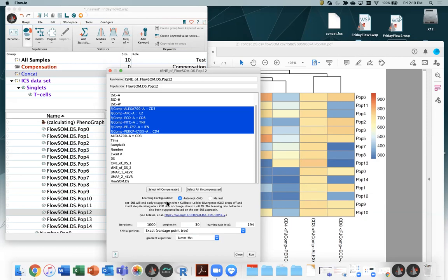We don't have those same levels of control built into UMAP or TriMap. Perhaps they don't need as much control, as I don't think they have the two distinct phases. They will try to, again, estimate a manifold, so if you don't get a good result out of UMAP, it's likely the amount of runtime it was given to optimize. And that one we have less control over. We spent an awful lot of time building very precise controls into t-SNE and building in algorithms. Another reason why I like that one specifically.